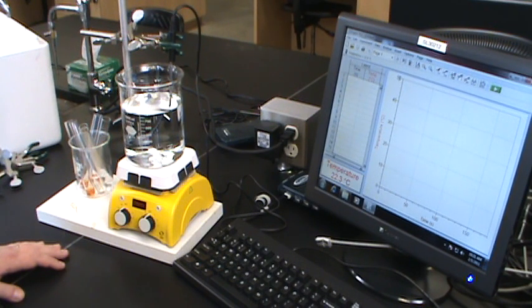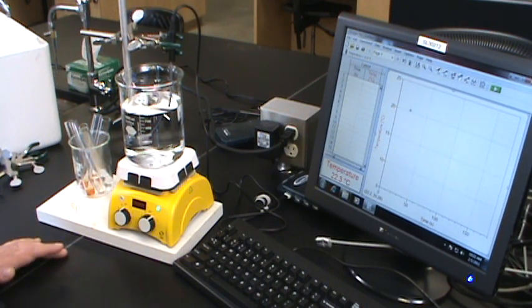So let's reset those limits, and I'll start it at 25. We'll probably lower it. We're going to want a bath that's around 10. So let me change that bottom limit to 5 to make it a little easier to see what's going on. I can turn on the stir and everything should be fine.